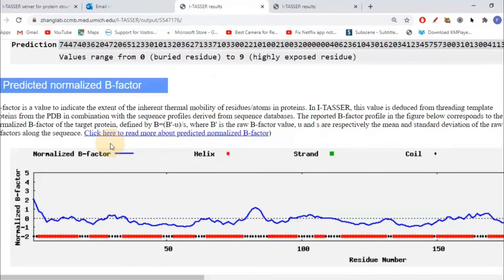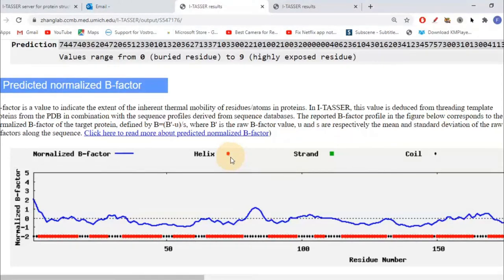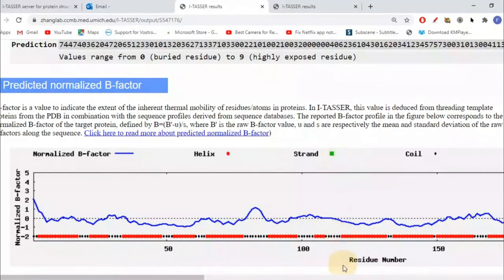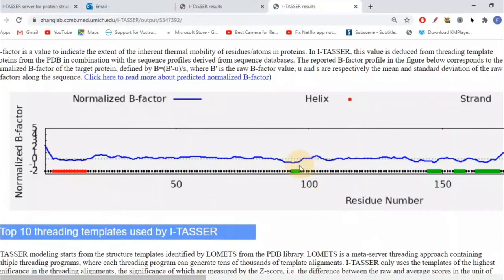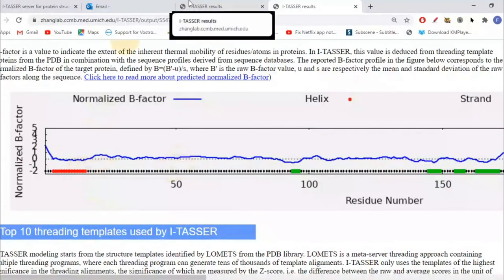Moving toward the next thing, which is the predicted normalized B-factor. Earlier, in the first section, alpha helices were represented by red 'H' and coils by black 'C'. But this time we are talking about structure graphically. In graphs we use symbols instead of alphabets, so the color is the same for helices but in a different shape or form. Coil is represented more like a dot in the graph. This dot represents coil and this red section represents alpha helices. My protein doesn't have beta sheets, so you won't see any green block, but in the second protein you can easily see beta sheets along with coils and alpha helices.